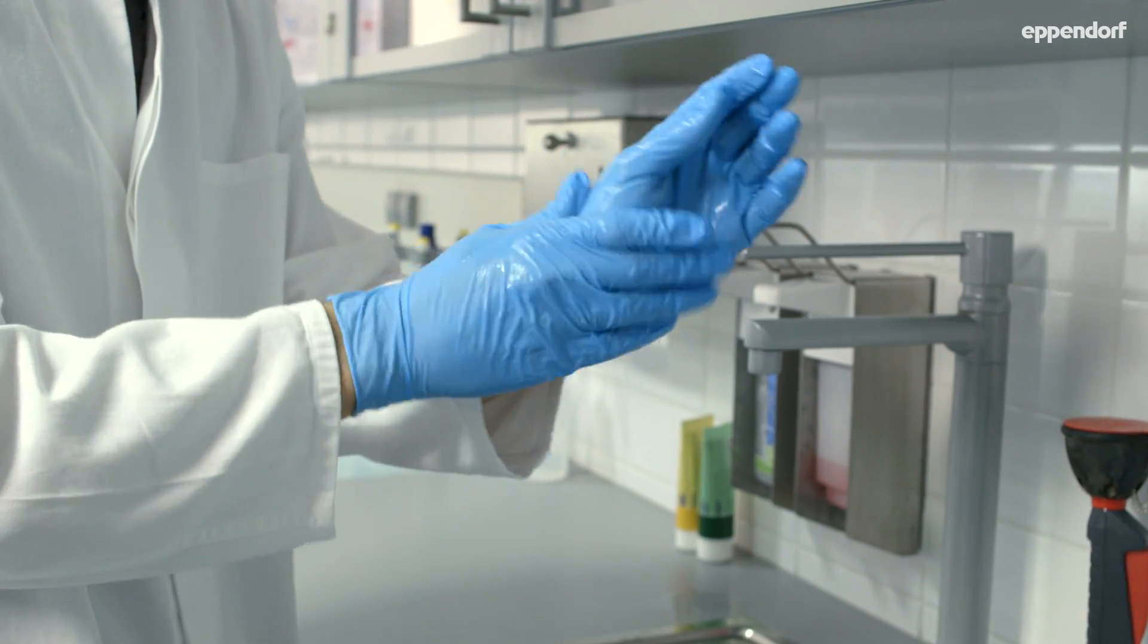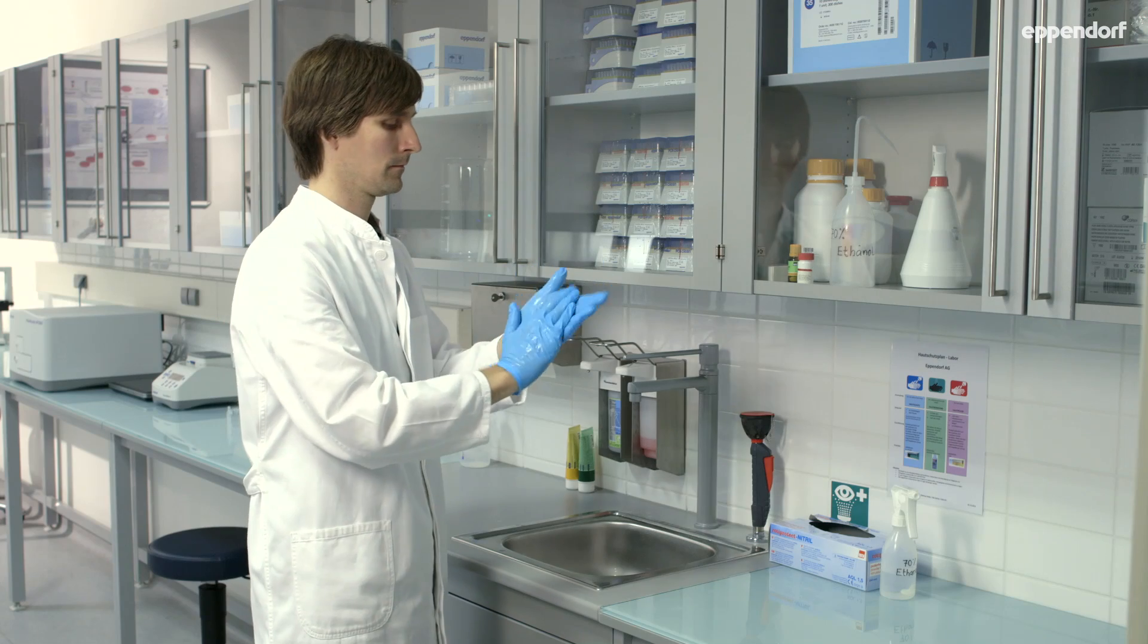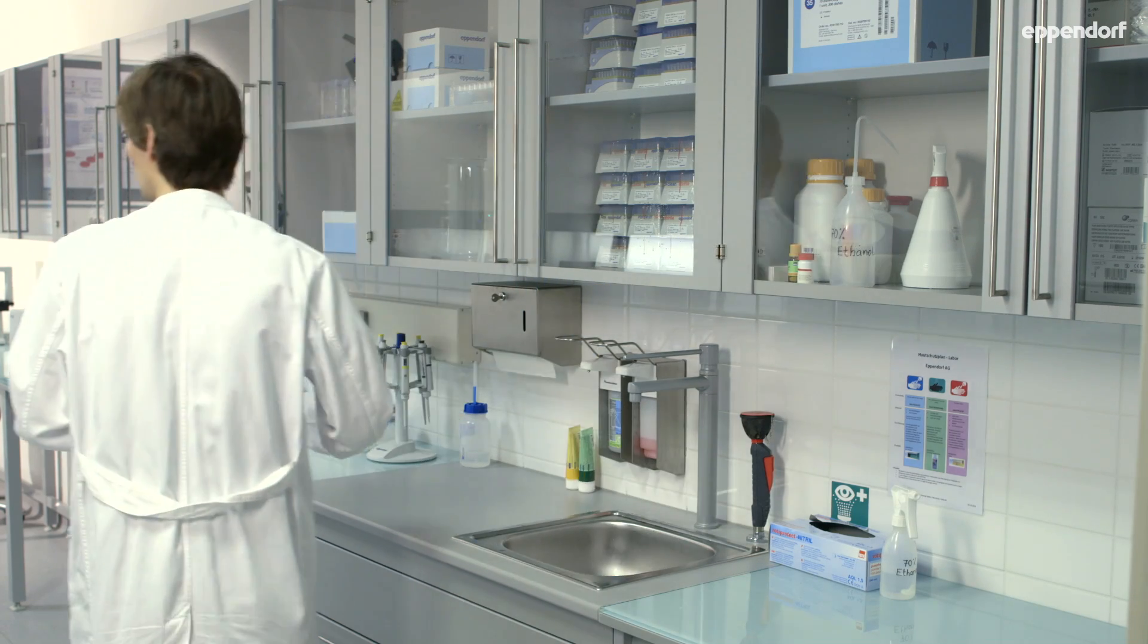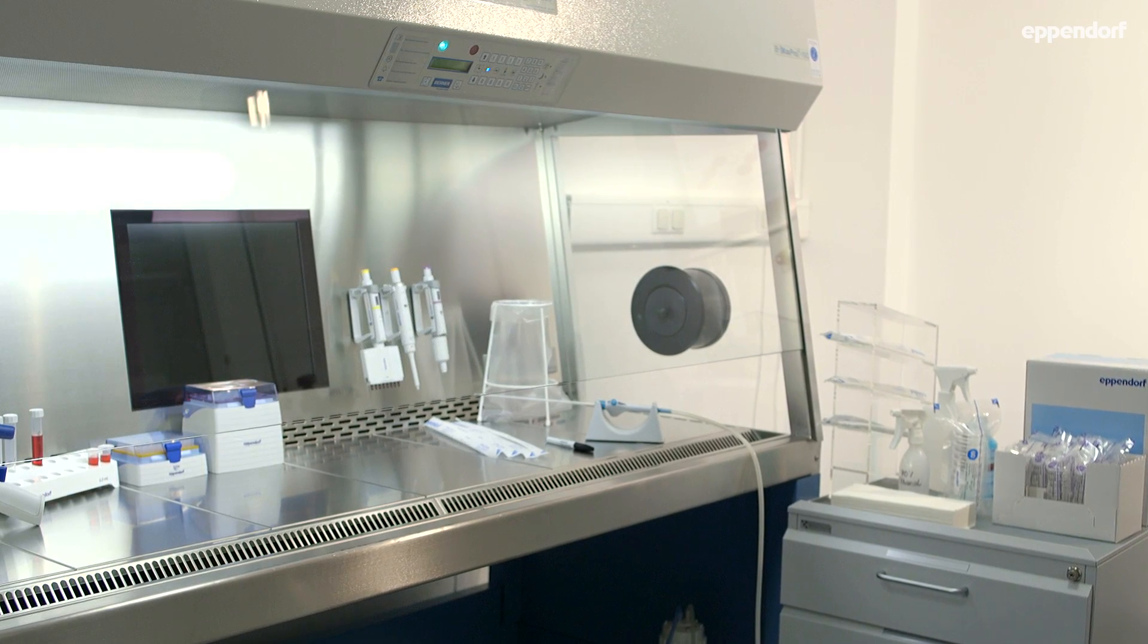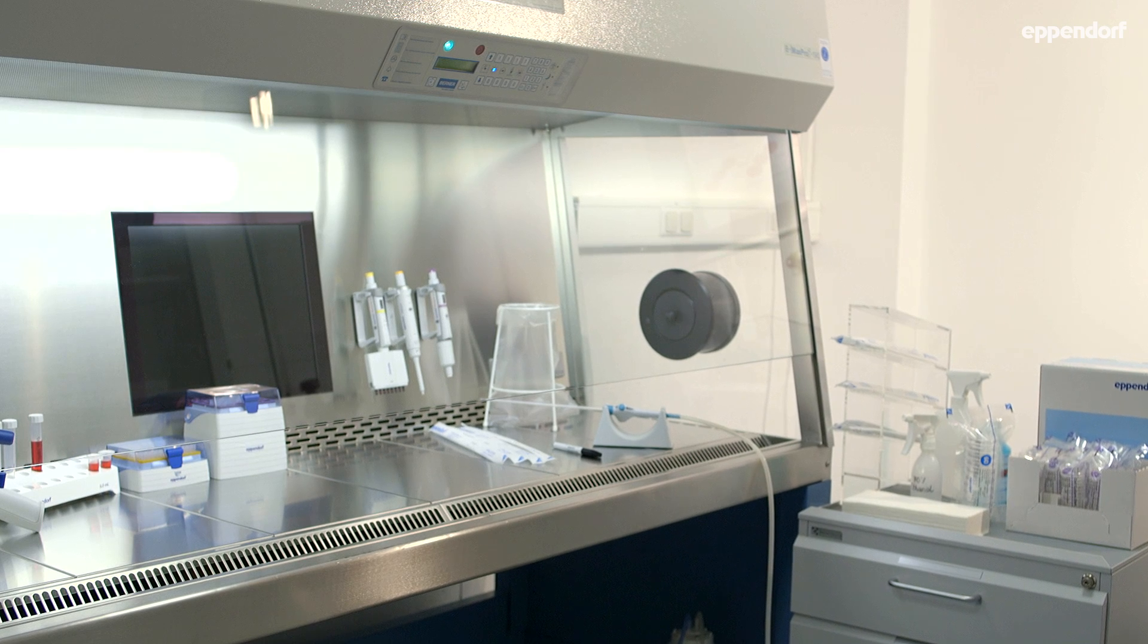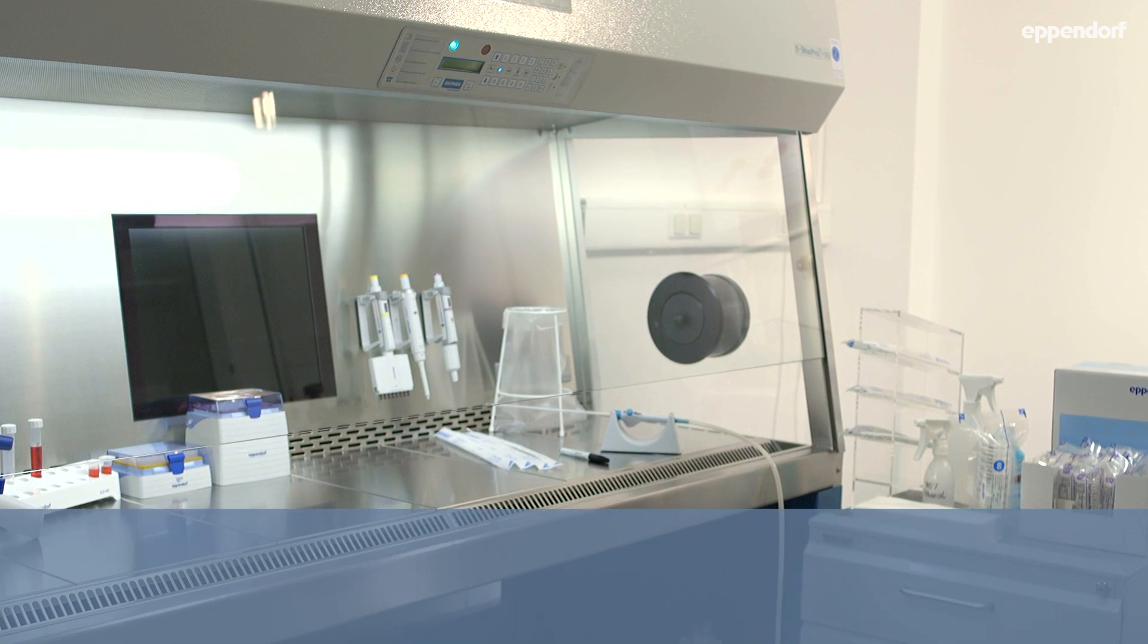After disinfection, let your hands dry before you start working. Make sure you have everything you need in the biological safety cabinet, but avoid an overcrowded workspace as the laminar airflow may be disturbed.